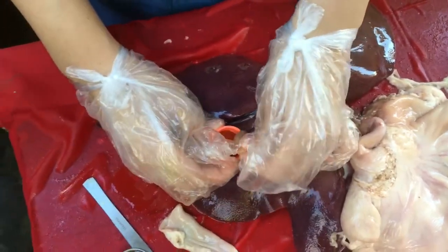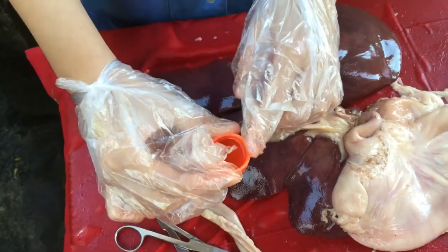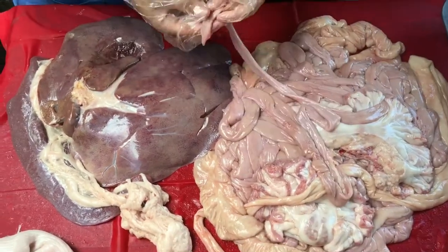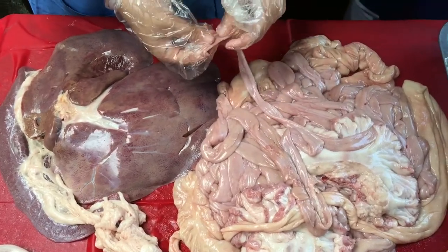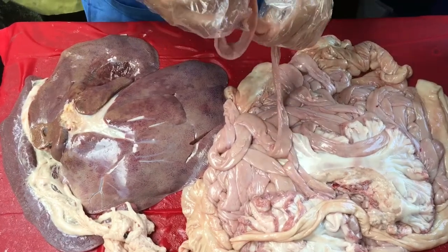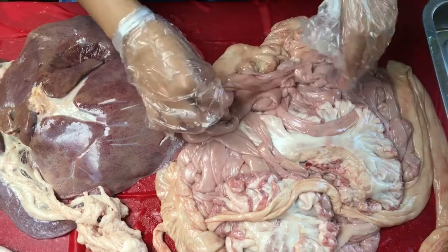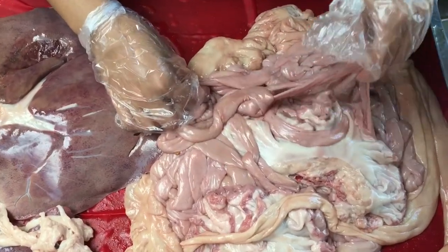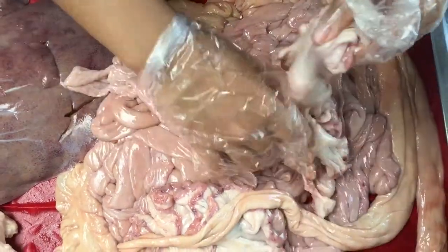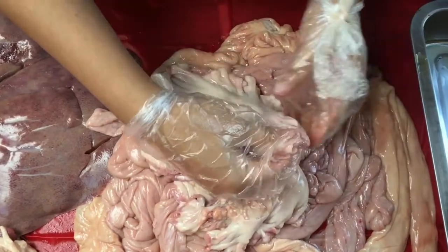And another part is the small intestine. We will now clean the small intestine and dissect it. This is the first part of the small intestine, the duodenum. This is the mid portion of the small intestine. This is a membrane system that holds the loops of the small intestine. It is called the mesentery.